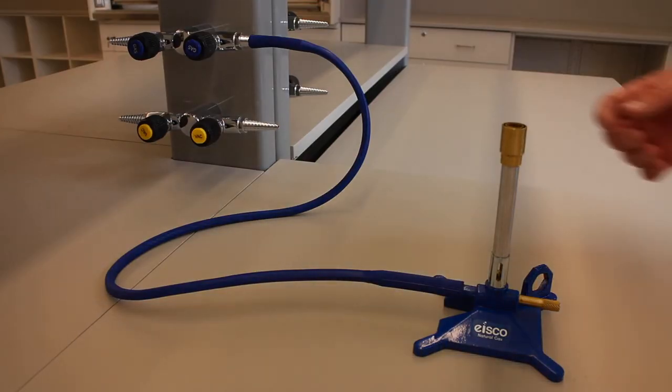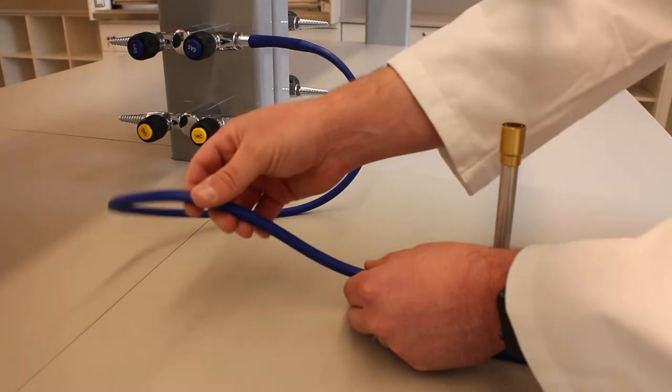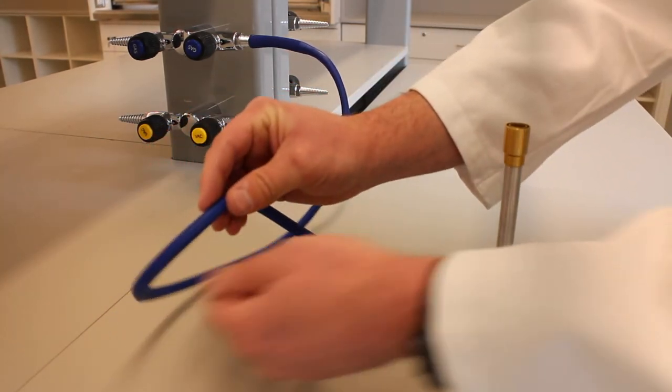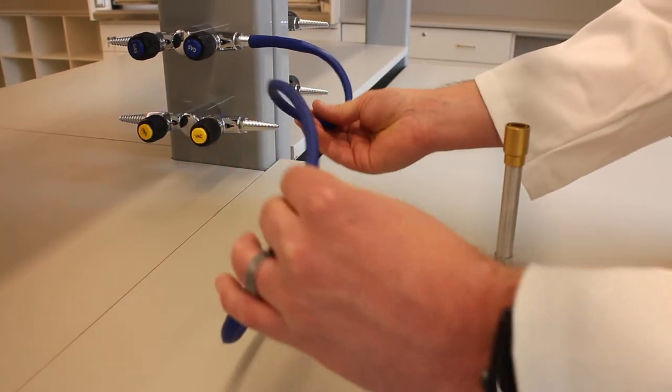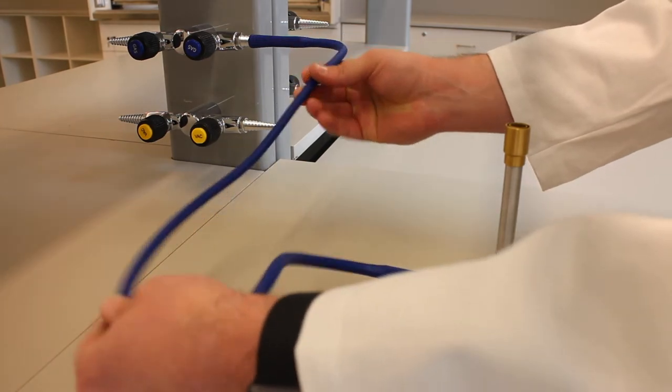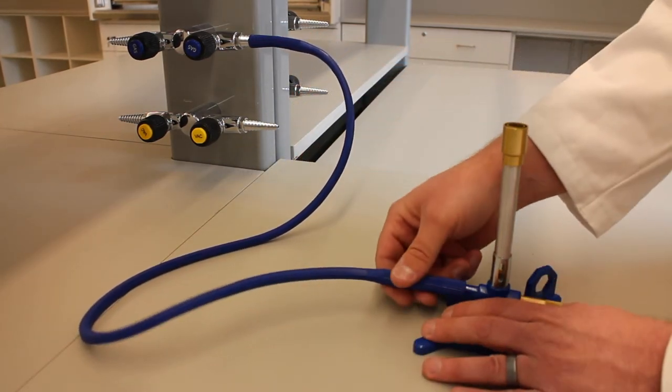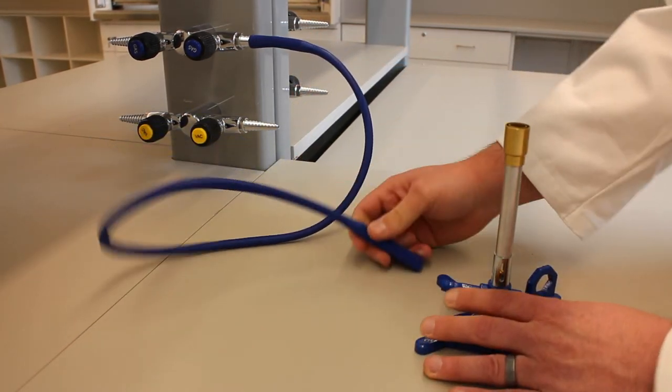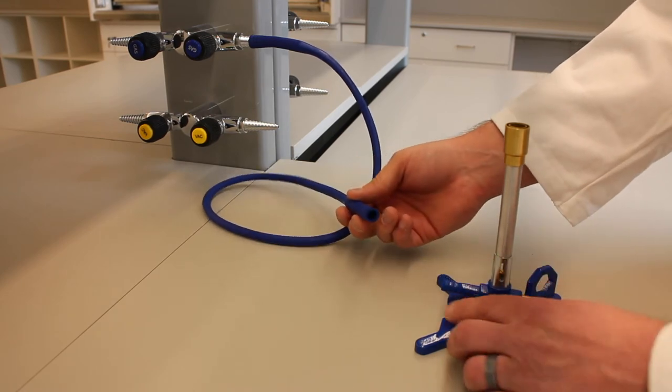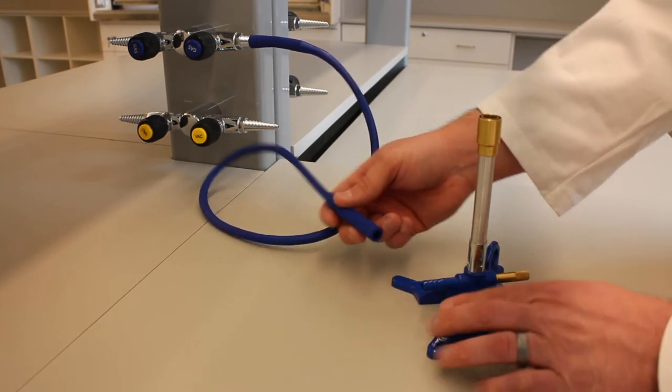Before using your Bunsen burner, start by making sure your gas hose is in good condition and doesn't have any holes. Then, ensure that both ends of the hose are secure, one to the gas outlet on your bench and one to your burner's gas inlet.